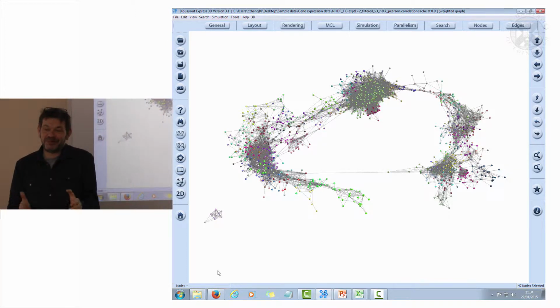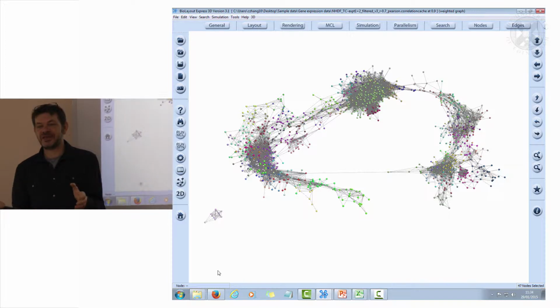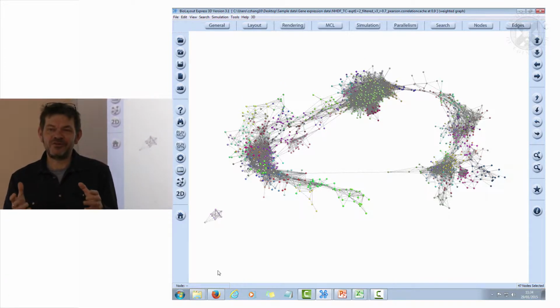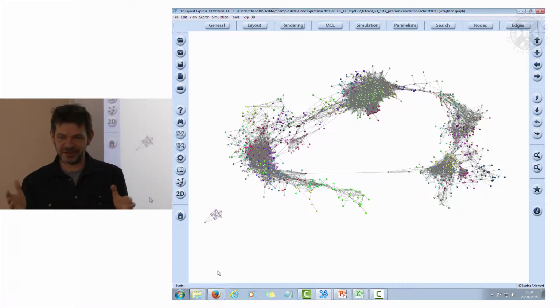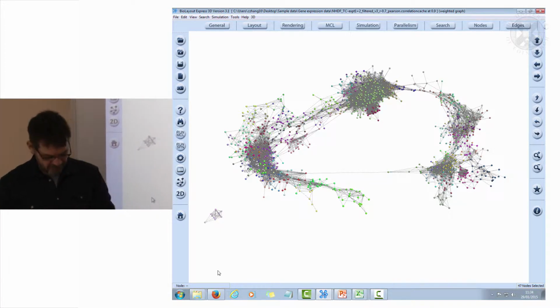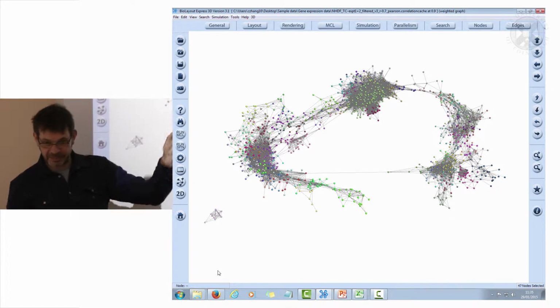I like that, but it does mean that if you ask the question, what's the difference between 0 and 12 hours, you can do that statistically, you can get a list of genes and you feel happy about it. What you don't know is really what background you've selected those genes from and whether there were any technical issues associated with the comparisons that you want to do. So just to say a little bit about how we might do this. This is a relatively simple experiment.